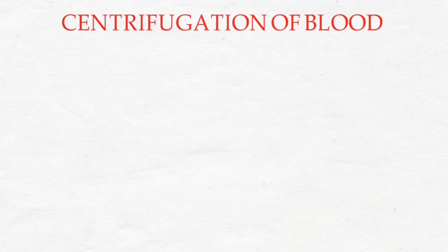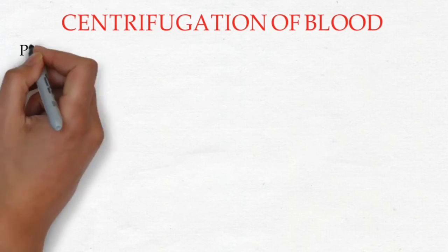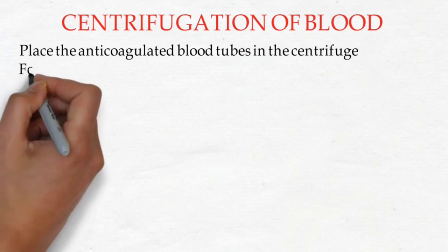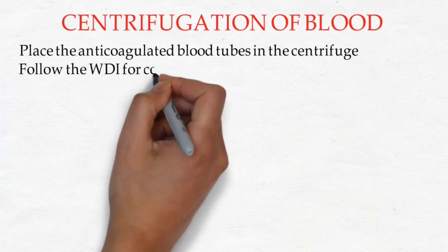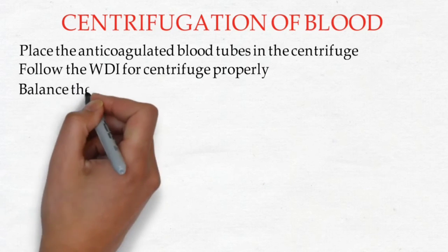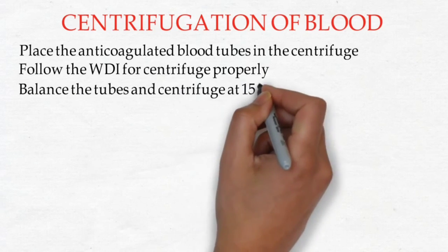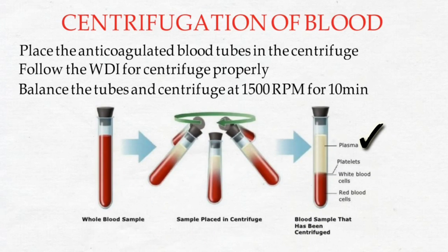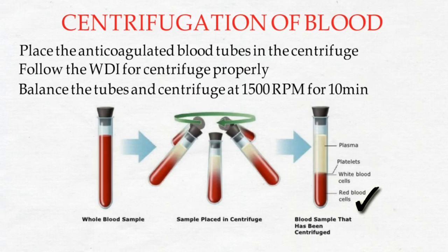Now we will perform centrifugation of blood. Place anticoagulated blood tubes in the centrifuge, follow the workdesk instructions for the centrifuge model, balance the tubes, and centrifuge at 1,500 RPM for 10 minutes. The plasma fraction, being least dense, appears at the top layer. The middle buffy coat contains the majority of platelets and WBCs, and the lowermost part contains the RBCs.